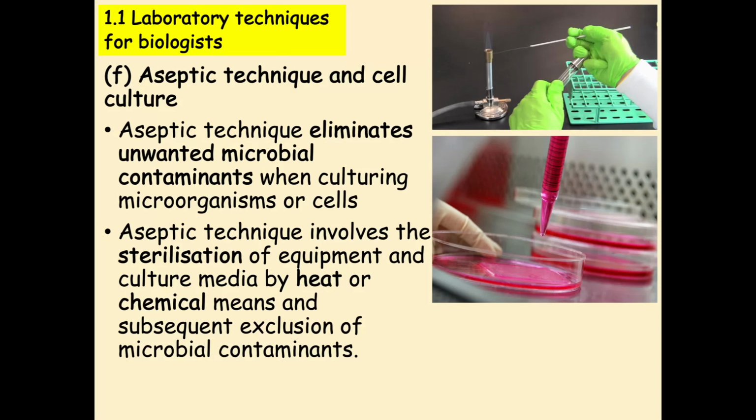We would heat the neck of the tube as well before we moved our bacteria or whatever it is that you're culturing, and we would use these techniques to help keep a sterile environment. Okay, one that is clear of any contaminants, because we do not want anything getting into our samples, or obviously anything from our samples getting out either.